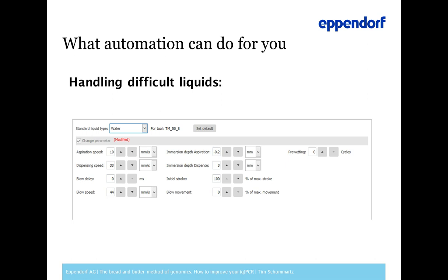If we talk about qPCR, there is a tendency to use a white plate because they do have better reflection properties. In this respect, I personally would prefer a white plate, and if you go for a transparent plate, I would do a test run. Besides the plate, it's not only the plate which is important, it's also the seal. So for the seal, you usually need a very transparent, high quality, clear seal in order to do qPCR to get your best result.